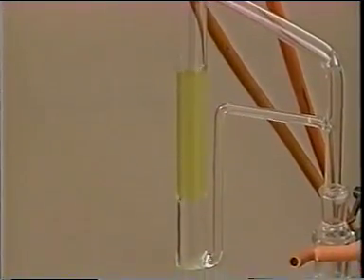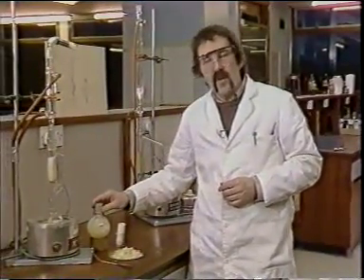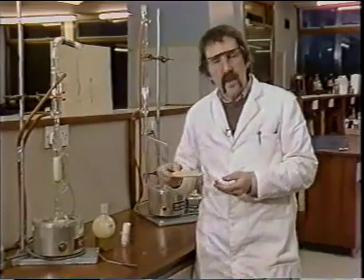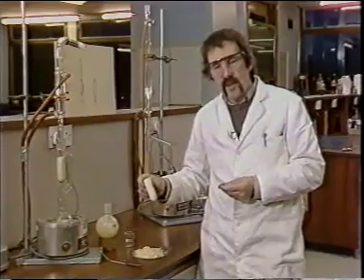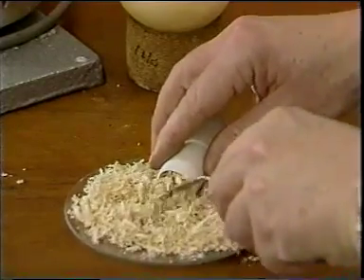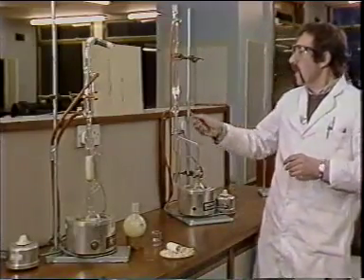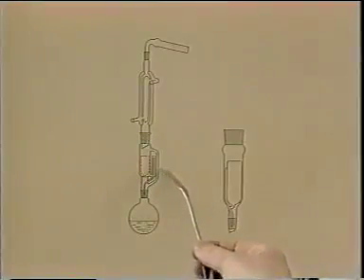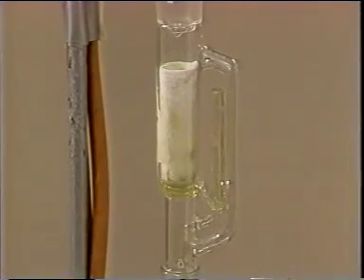A second problem which can also be solved by a continuous extraction technique is where we need to leach a solid from a reaction product or from a natural material. It could be a Wittig reaction like this one, or a natural product like these heartwood shavings. The solid material is packed into one of these filter paper thimbles, and the thimble is placed in one of these automatic siphons. Looking at the diagram of the apparatus, we see that the siphon is placed between the refluxing solvent and the condenser. This apparatus is called a Soxhlet apparatus after its inventor.